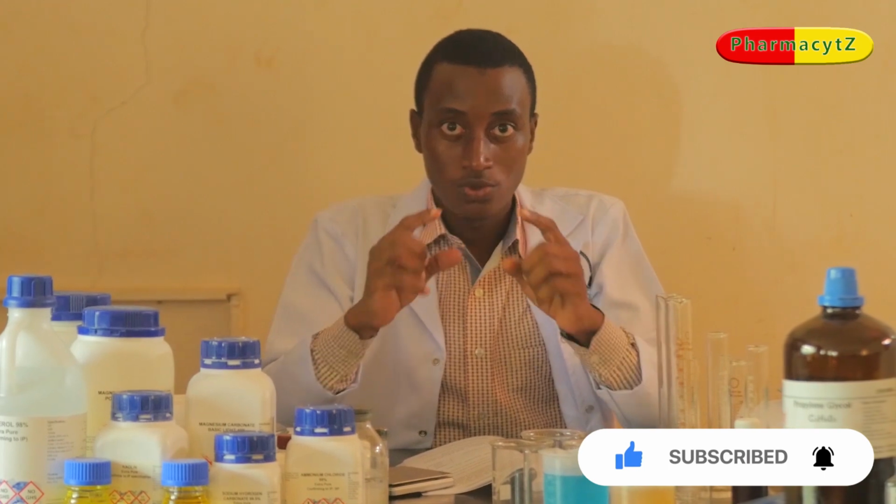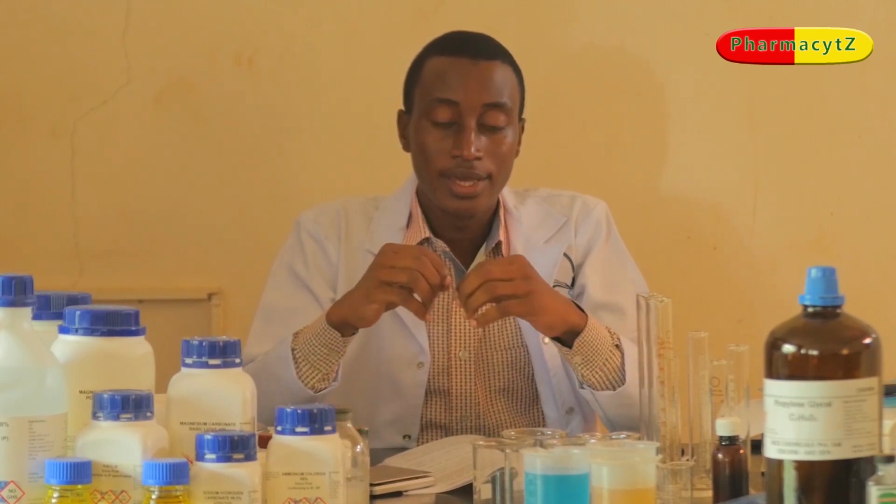You have observed that we have potassium iodide, iodine, and purified water. During the making of this, you need to be careful due to the solubility complex. When you mix iodine crystals in water, in fact, it doesn't dissolve. So what you need to do is first make the solution of potassium iodide.